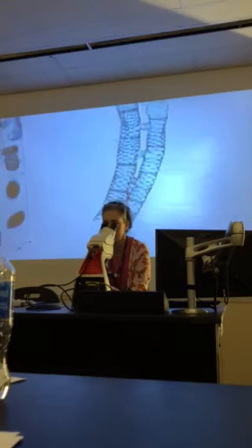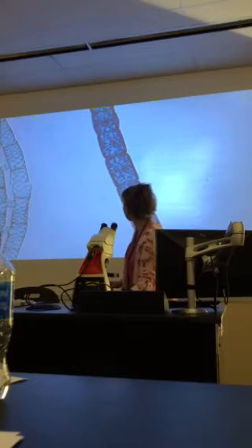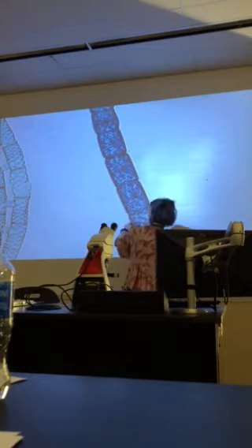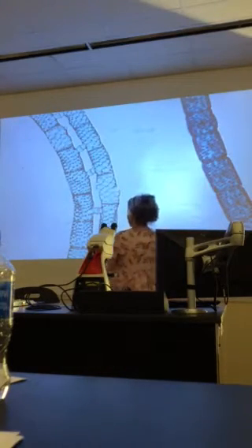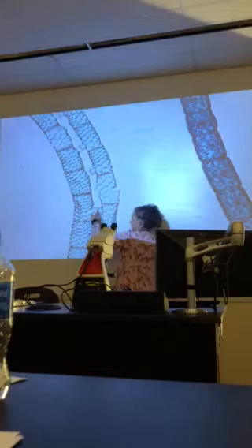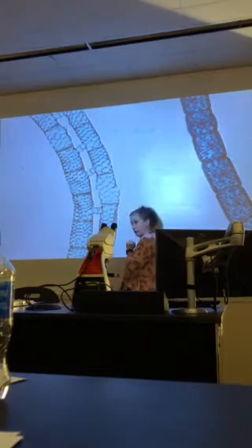So who do we have here? Spirogyra. Very good. What do I call this little prominent guy right here in the center? Nucleus. What are these little dots? Chloroplast. What do I call that? Cell wall. What do I call this thing that is joining these two guys? Conjugation tube.